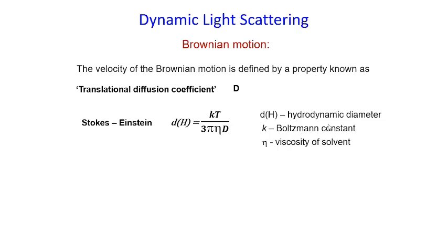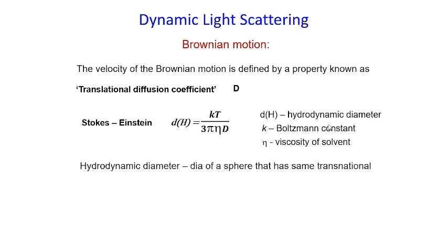Now, this hydrodynamic diameter is defined as the diameter of a sphere that diffuses at the same rate as the particle being measured, right?